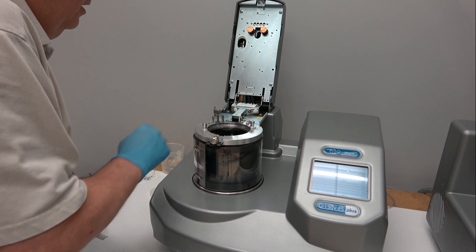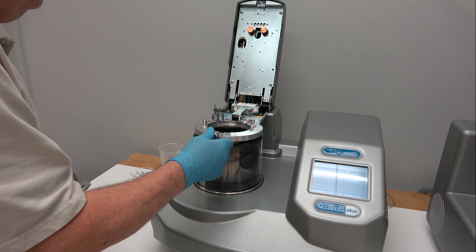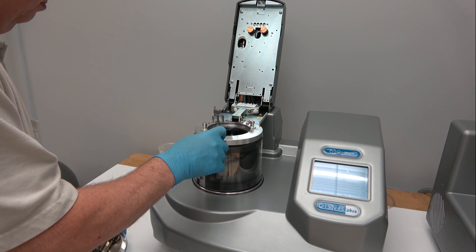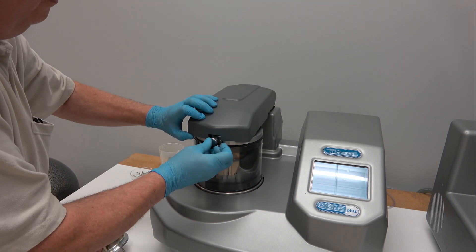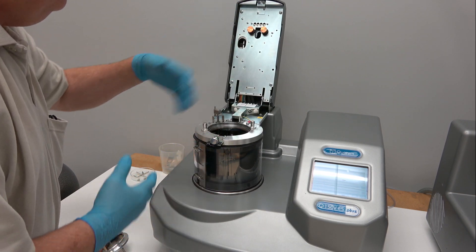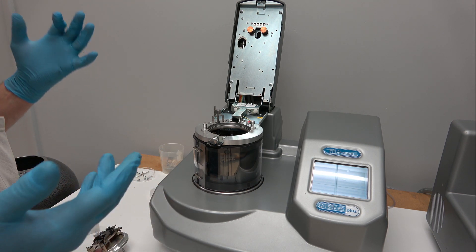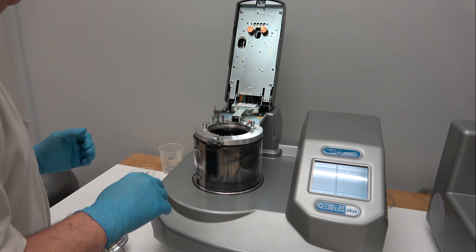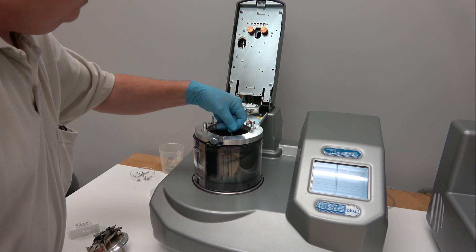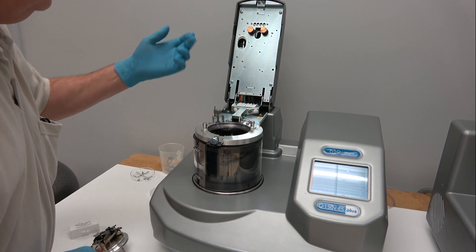On the top of the Q150 series you have an upper and lower half of the arm. I have them already split but they get put together by that latch, and it allows you to change inserts between carbon rod, carbon cord, sputtering, metal evaporation, or whatever accessories you have. There's an o-ring here and you always check to make sure there are no little bits of carbon, dust, or dirt on the o-ring so you get a good seal.